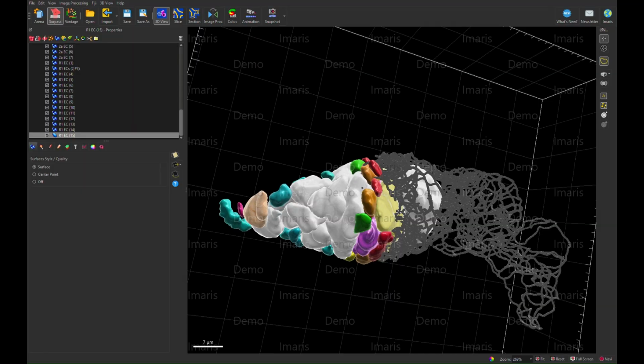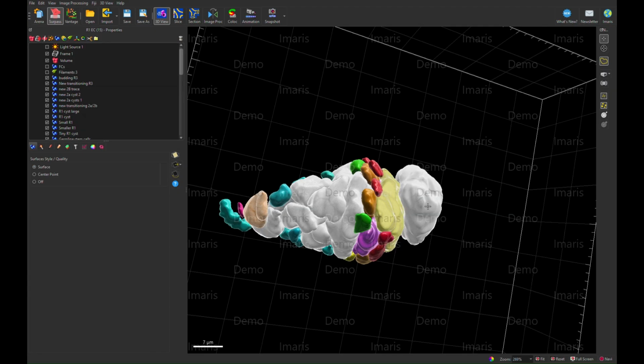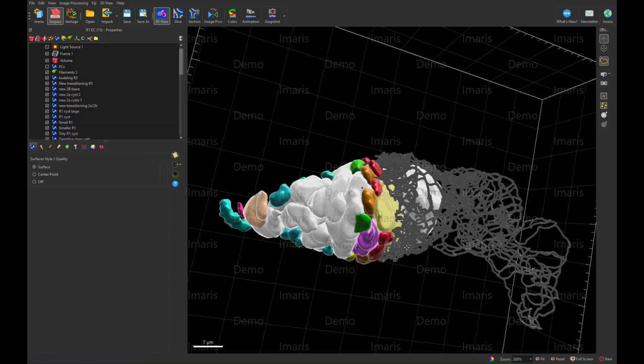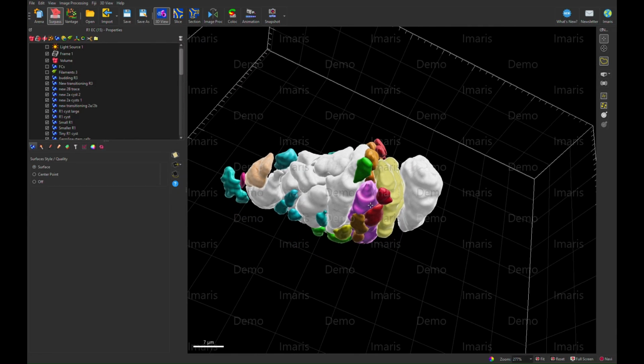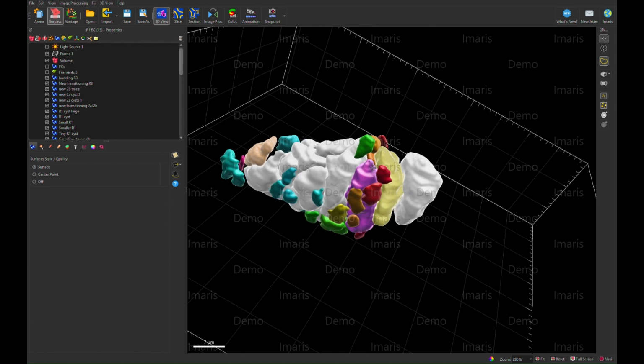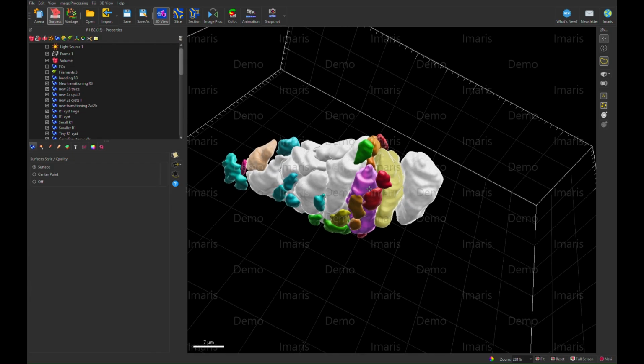Okay. Now let's take a closer look at the region 3 cyst. So here it is, it's starting to round up a lot. Just anterior of it, the yellow one is also starting to round up, and both of those are surrounded by the Fas3 protein. These are going to also be surrounded by follicle cells, which have been differentiated. And anterior of that, you have the pink 2b cyst, surrounded by the red layer 1s, the orange layer 2s, and the yellow layer 3 follicle stem cells that are near the Fas3 expression, but not surrounded by it.